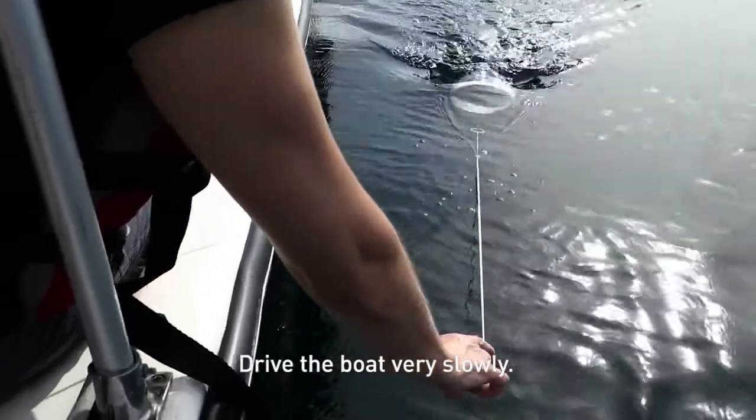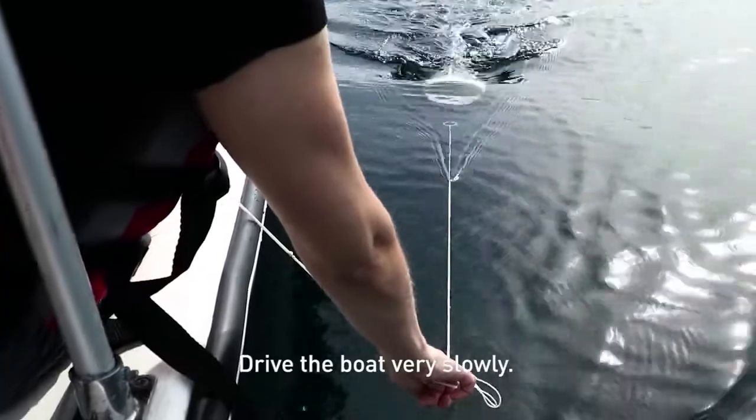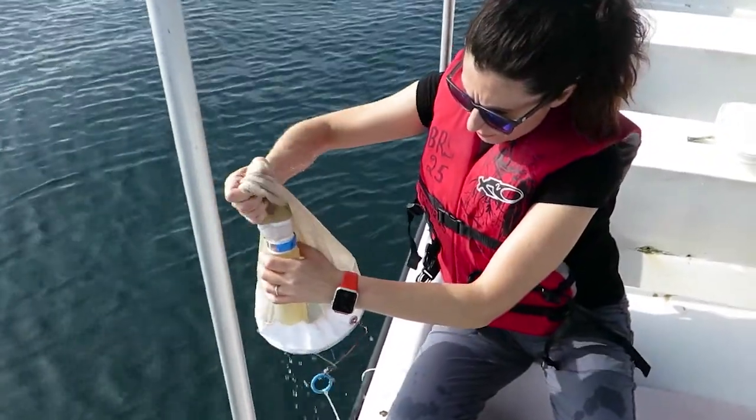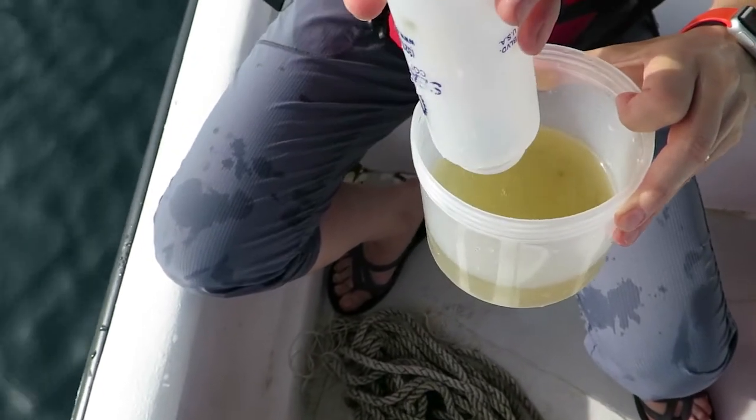During the sampling, make sure the mouth of the plankton net is under water at all times. Once you collect the plankton, empty the end jar into the sample jar and put it in a cooler.